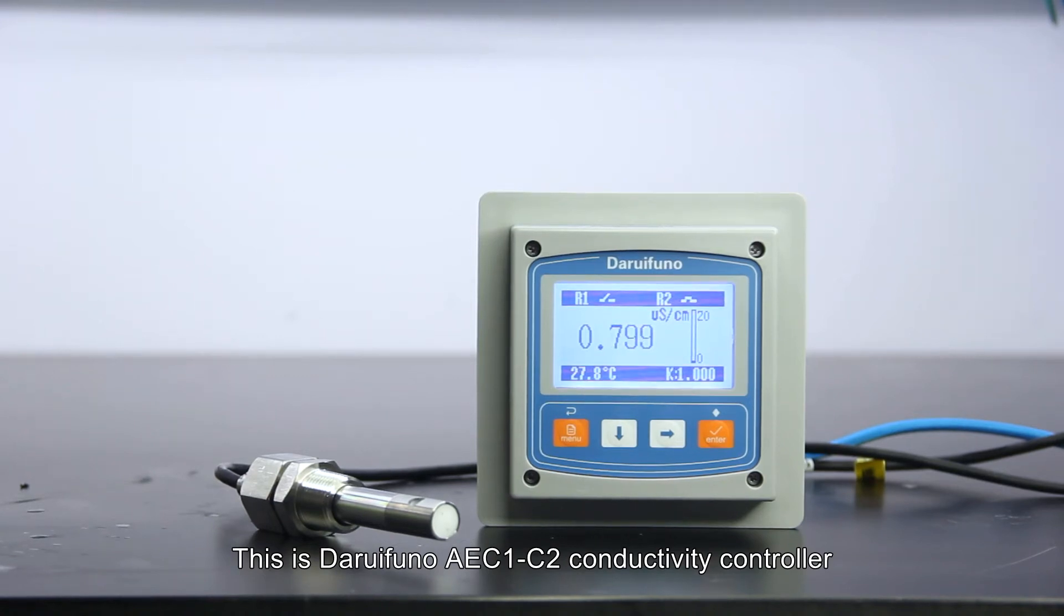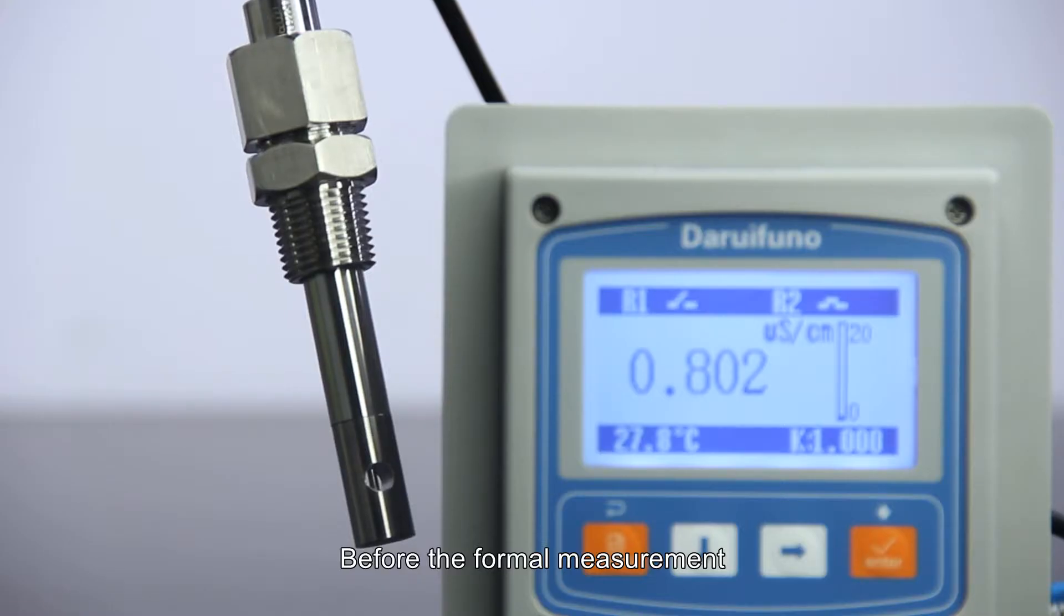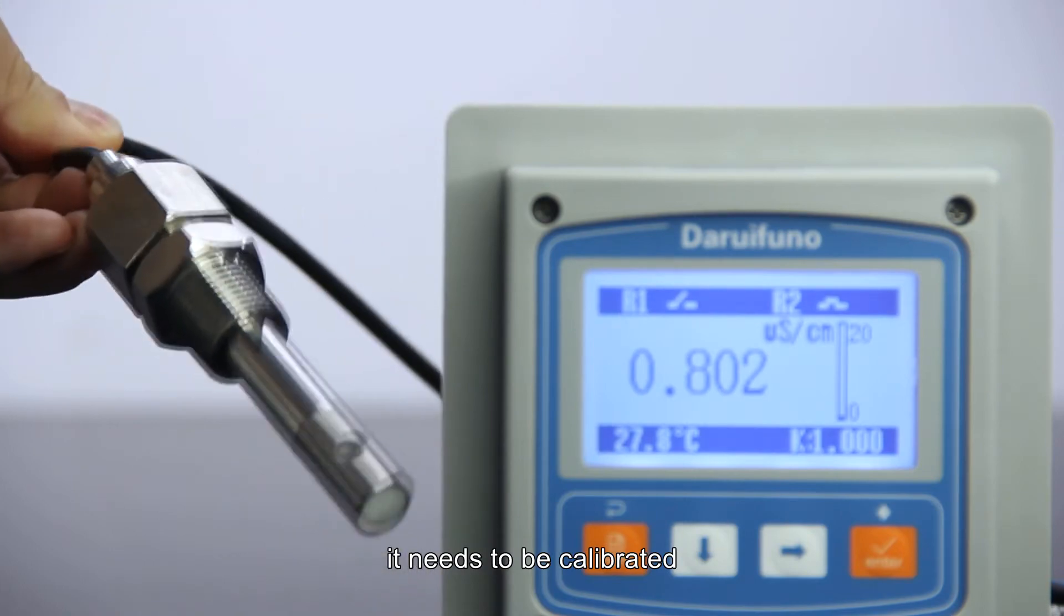This is Daruifuno AEC1-C2 Conductivity Controller. Before the formal measurement, it needs to be calibrated.